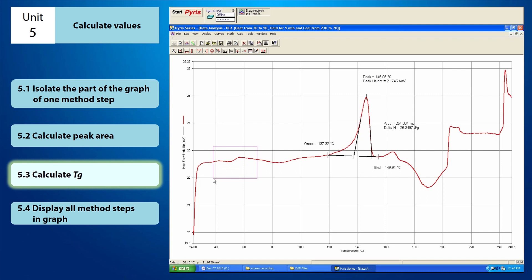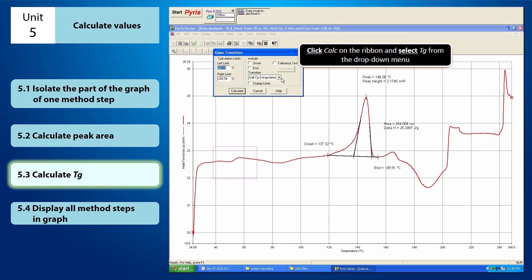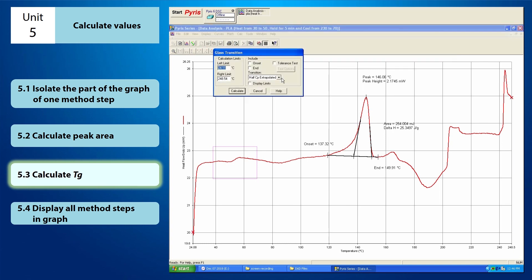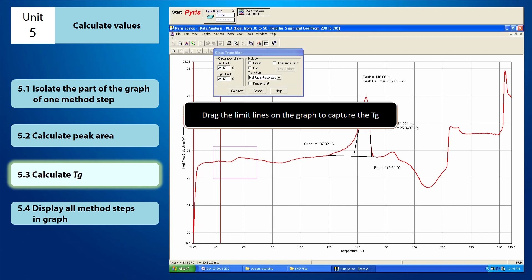Now you can begin to calculate the TG. First, click Calc on the ribbon and select TG from the drop-down menu. Once you have clicked TG, the glass transition window will appear. From here, you have to set up the glass transition window. You need to drag the limit lines on the graph in order to capture the TG.